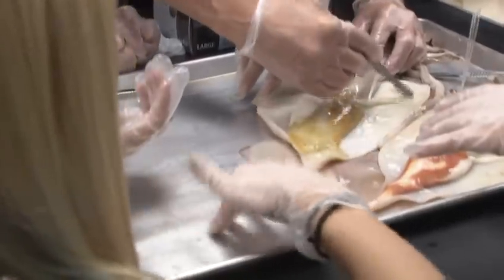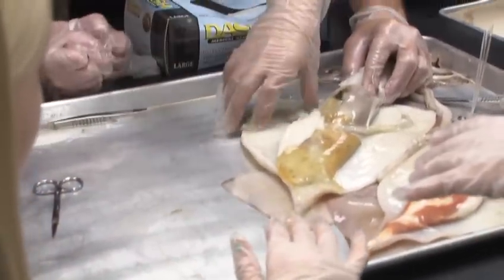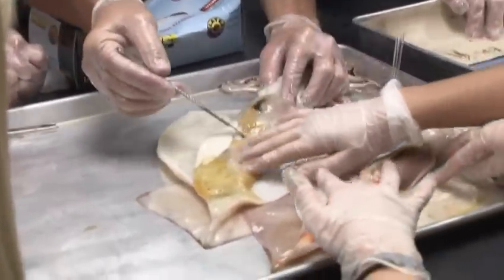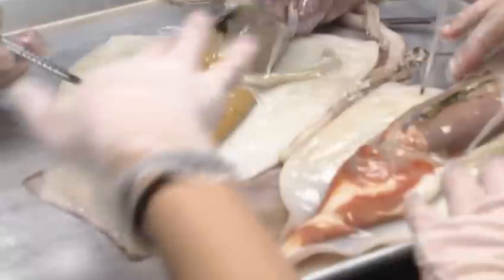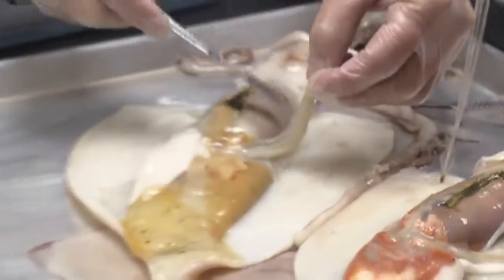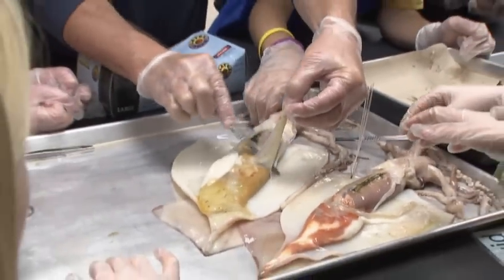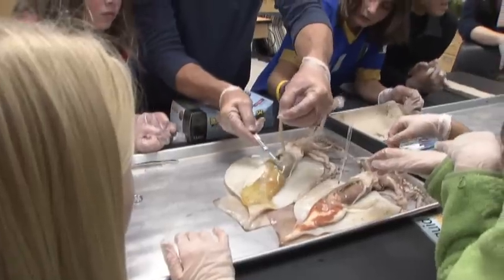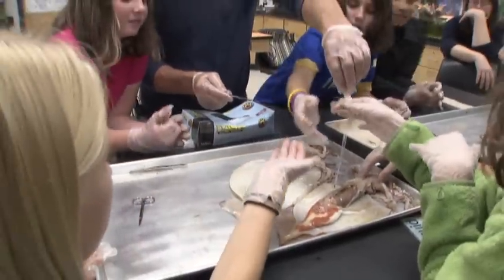Now these are the gills right here. You see this? And they have three hearts. They have one heart down here for the whole major parts of the body, and then they have a heart here. Well, they're hard to see, but they're right down in here. This is a little pancreas area down here. But look, everything is held together by mesentery. Look, see that? How many chambers on a heart? There's just three apiece for the big one here, like the atria, and there's a ventricle. But here's a gill. Okay, there's a gill.